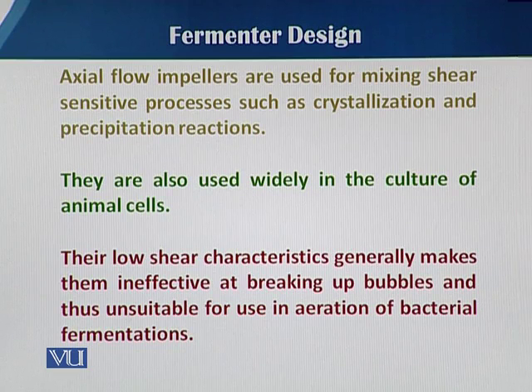Sometimes when the product is based upon crystallization and precipitation, there is a chance of breakdown of those crystals, so we cannot use the radial flow impellers. That's why we use the axial flow impellers.